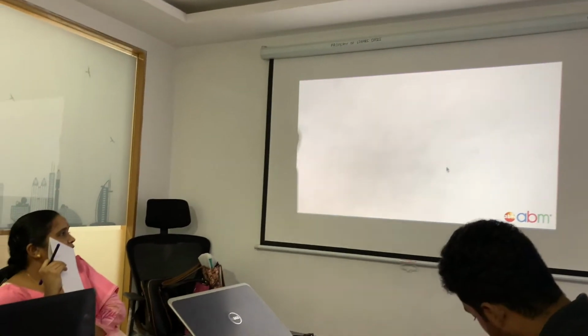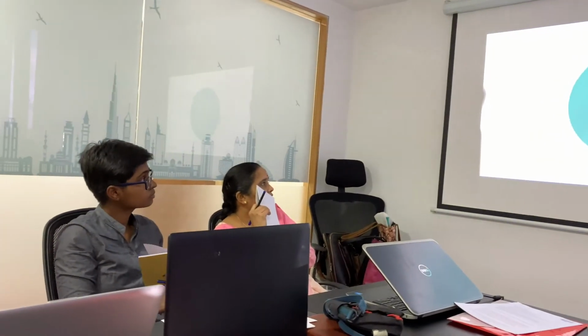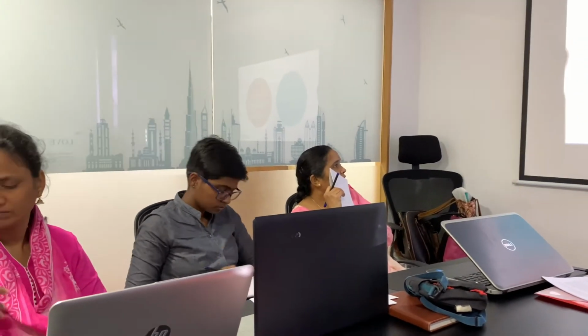However, if multiple samples were run on the sequencer, then the .bcl raw data must be sorted to separate reads in a process called demultiplexing. This demultiplexing process converts .bcl data into universally used.